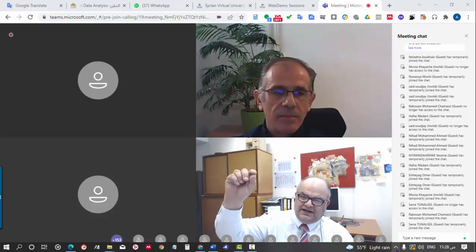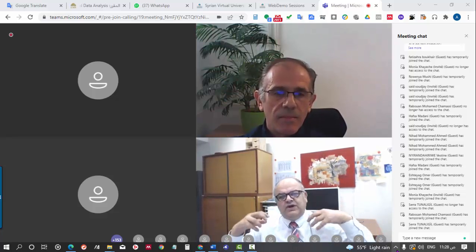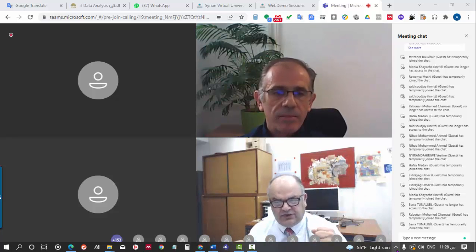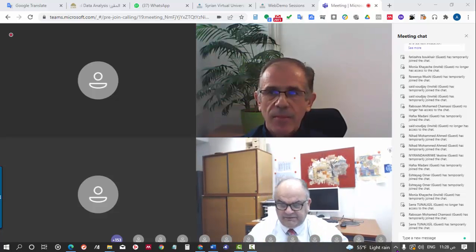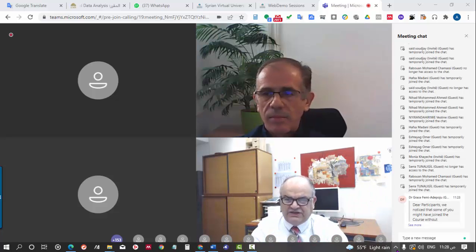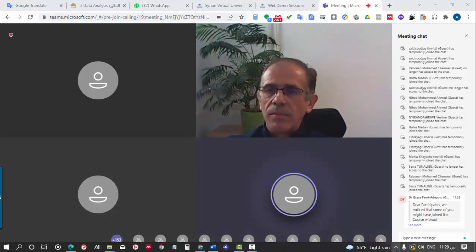So you will see a number there: laboratory number 7 performed this, laboratory number 11 this. Then you can see your lab operating alongside other laboratories and determine the gaps and the targets to improve for the next proficiency test. So overall, the process of harmonization covers all these activities that we mentioned during this week. Thank you, Ivancho.